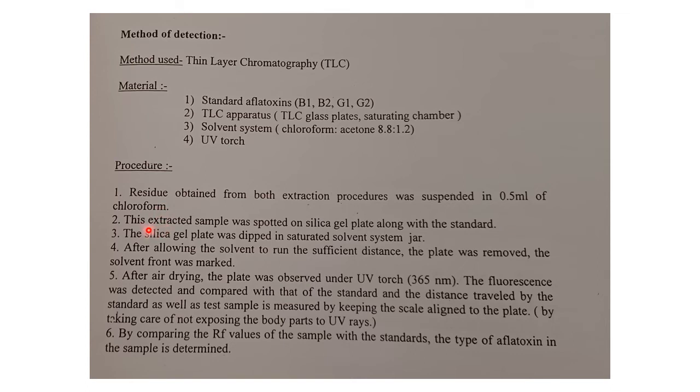So you need to spot your sample, so that's why we need to suspend the extraction powder or the residue that we obtained in chloroform. This extracted sample was spotted on a silica gel plate along with the standard.